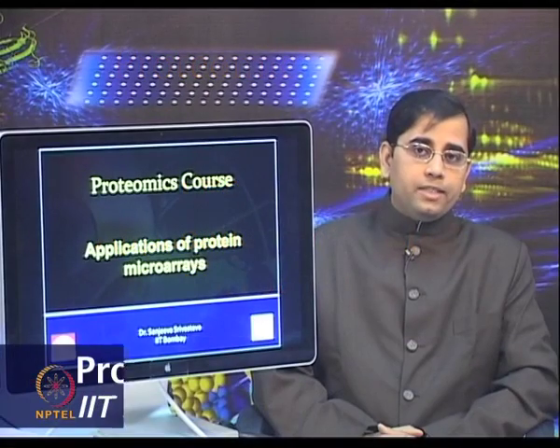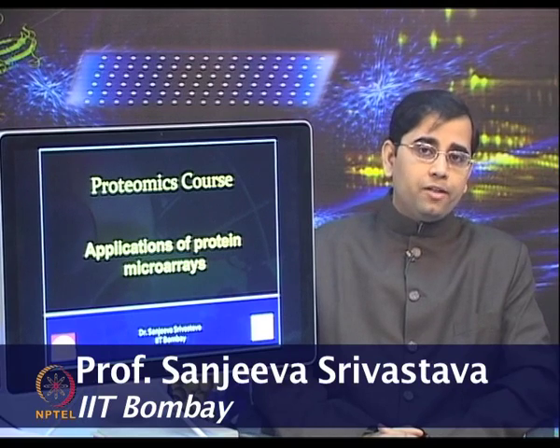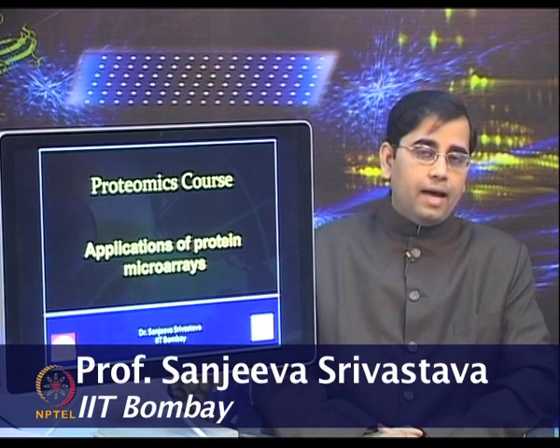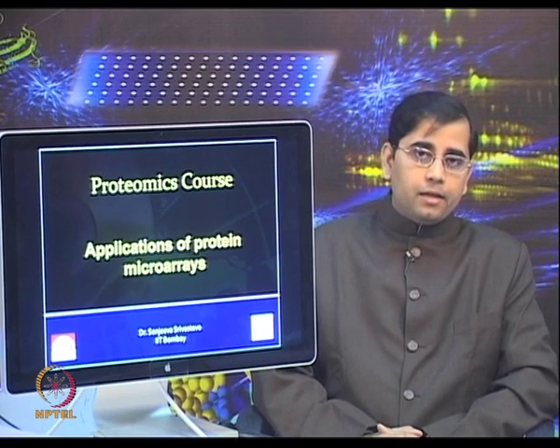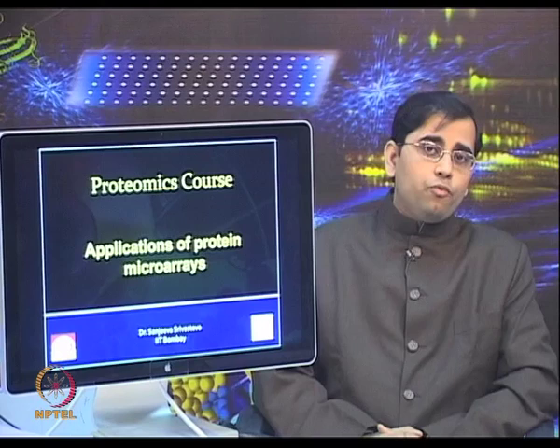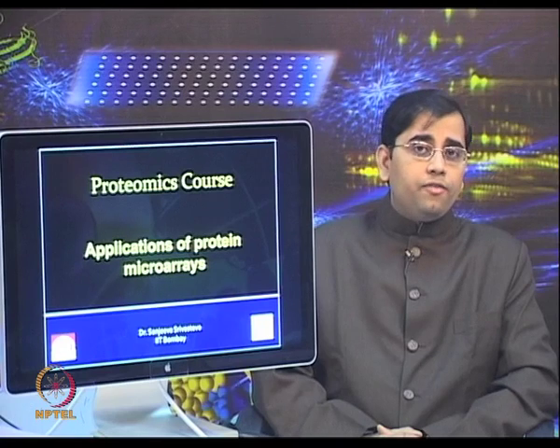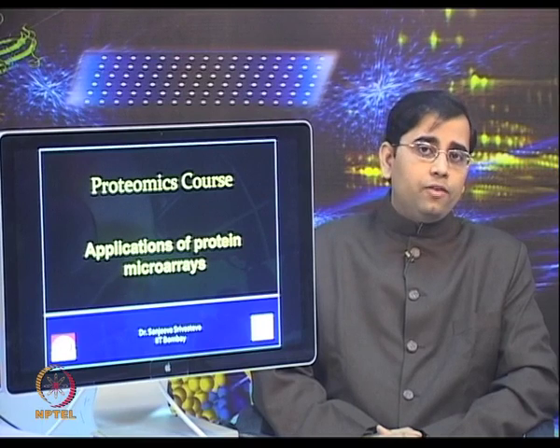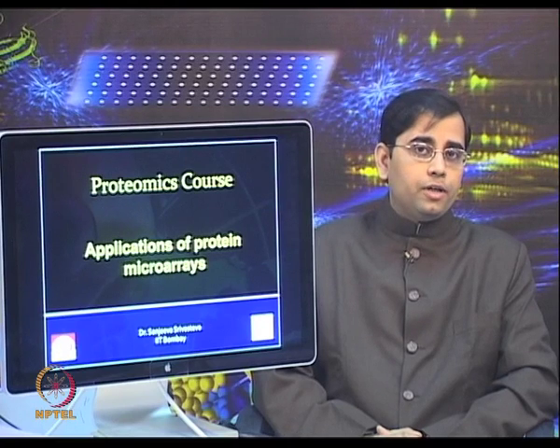The protein microarray technology has the potential to become one of the very powerful tools in the proteomics field due to its enormous potential in diagnostics and drug discovery. These high density protein arrays, which are printed on glass substrates, have been used for proteome wide analysis. Whether it is human or yeast or different types of bacterial species, these high density protein arrays have shown a wide variety of applications and great potential for high throughput applications.